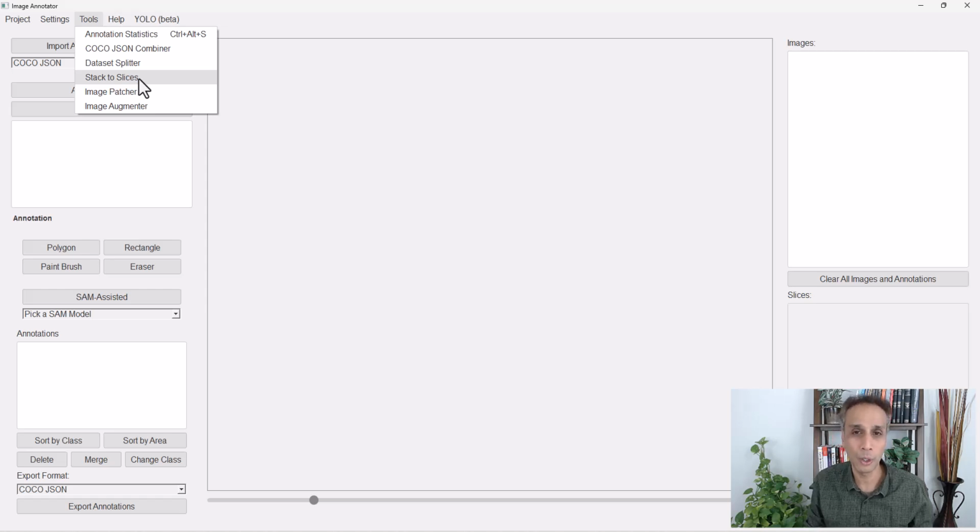So why do I load an entire TIFF stack of 1,000 images or even 100 images and spend my time annotating every object in every image? I'll just do 3 images with 20, 30, 40 objects and see how the result looks, right? So you always need to just extract some slices for training purposes.